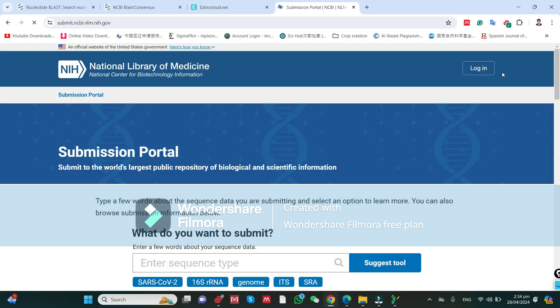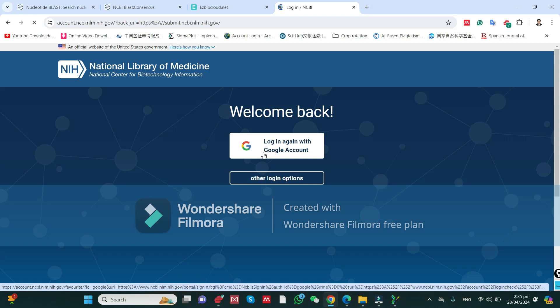You need to log in. If you do not have a login ID, you need to create one via Google, Yahoo, or any others. You can easily link it with your account. Click on login. I have an account linked with a Google Gmail account, so it is directly going to Gmail. Clicking on login into the Google account, otherwise it will show all accounts from Gmail, Yahoo, Hotmail, and many others.